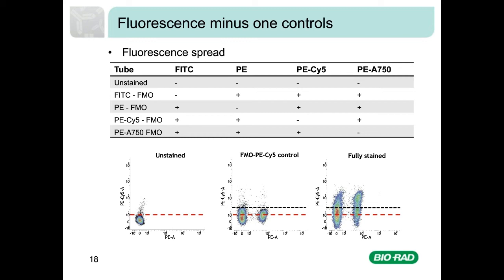It is important to perform an FMO control for all of the fluorophores in your panel when starting a new experiment, as it will allow accurate setting of gates. However, it is best to avoid spread as much as possible in your experimental setup by avoiding spillover and therefore compensation and data spread into channels requiring high sensitivity.